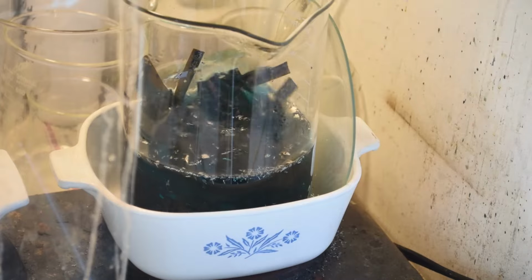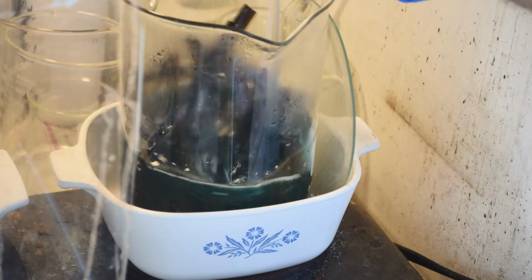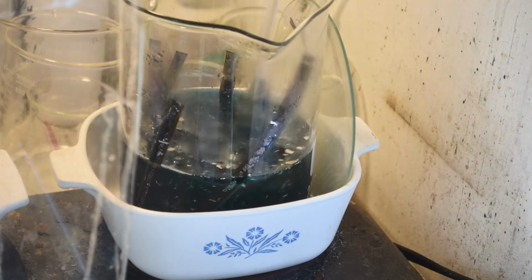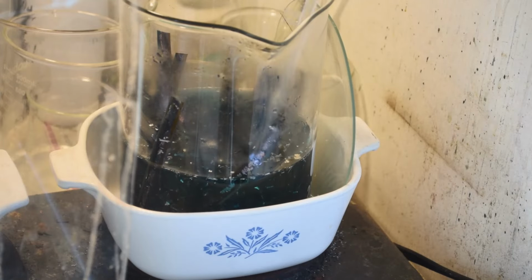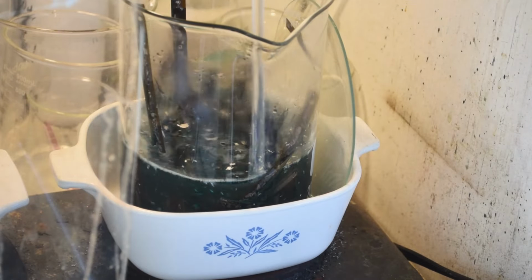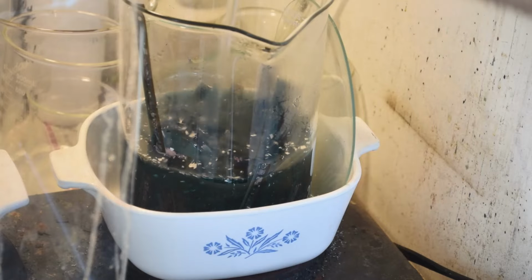Alrighty, until I came over here and stirred this stuff, I had no idea just how many foils were in there. This thing is loaded with those silvery metal foils. Whatever they are, they're not dissolving in the nitric acid solution. And I can now see areas of copper on the strips. I couldn't see that before. So, yeah, I don't know what's going on here. Joven, what have you sent me? I don't know.